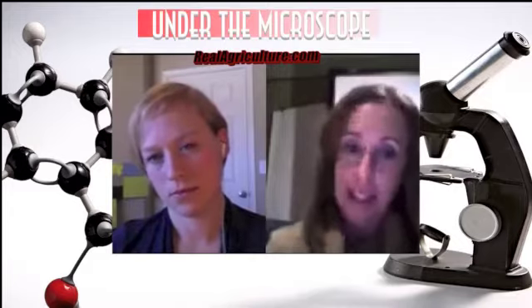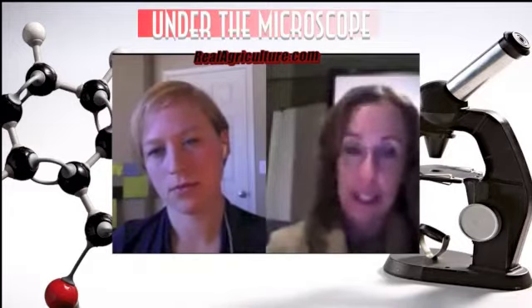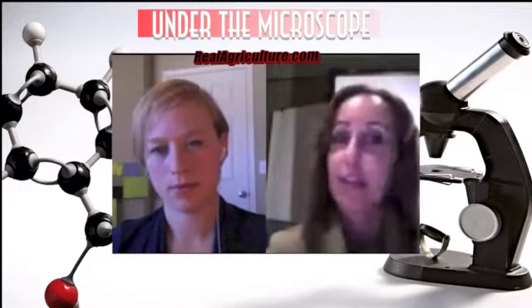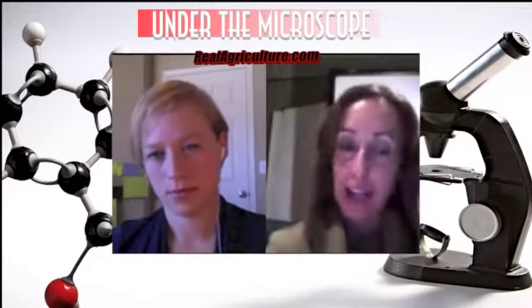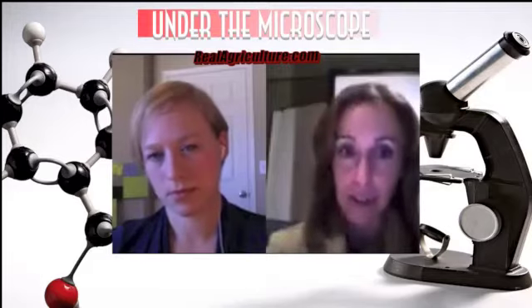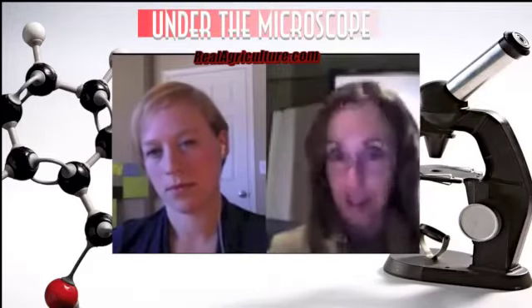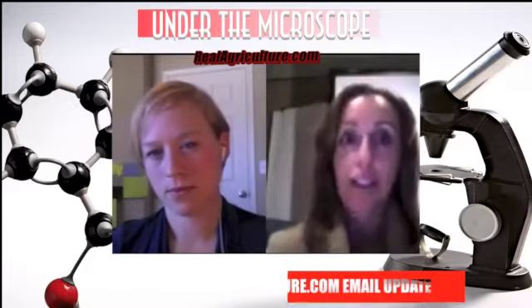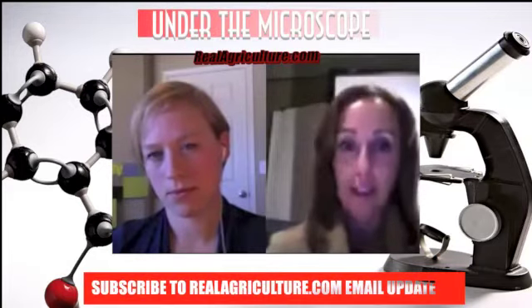The second thing would be to do a kernel weight test. Now, peas can vary extremely in size. They can be as low as 180 grams for 1,000 kernel count, up to 300. So that's an extremely broad range. So our recommendation is to do that package, the germination and the kernel weight.